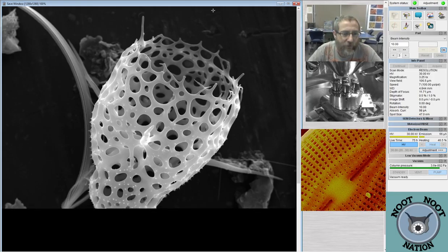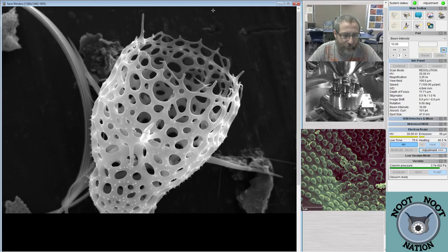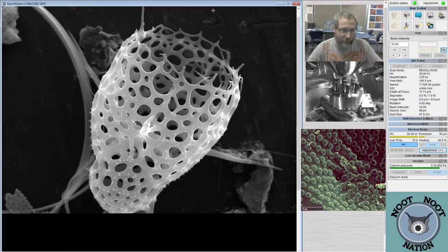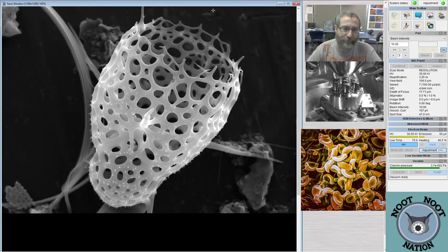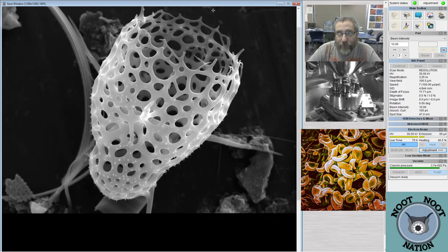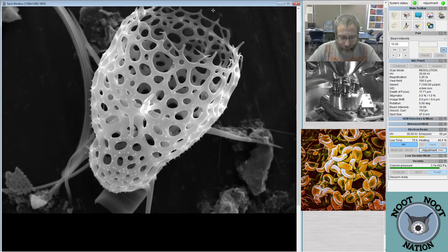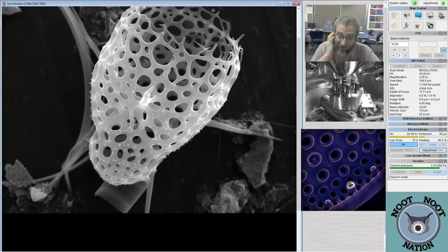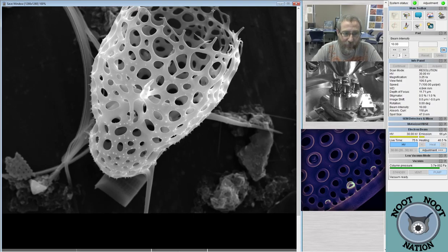So they will be found in soils, but it'd just be the ones living on the surface, because once you get down into the soil, there's no light. But tree bark, plants, on the surface of plants, wet cave walls, rocks, anywhere there's just a little bit of nutrients and light and some moisture, diatoms could live.